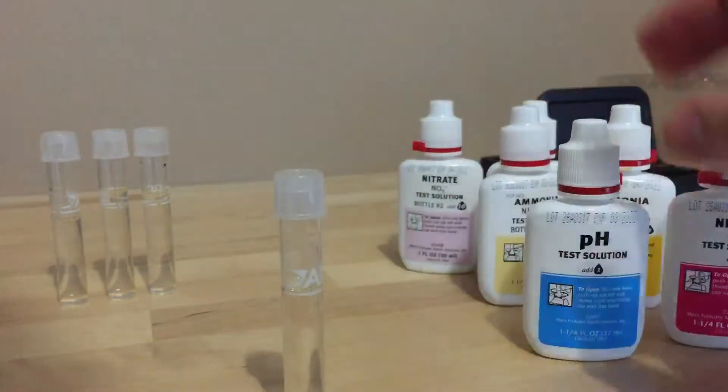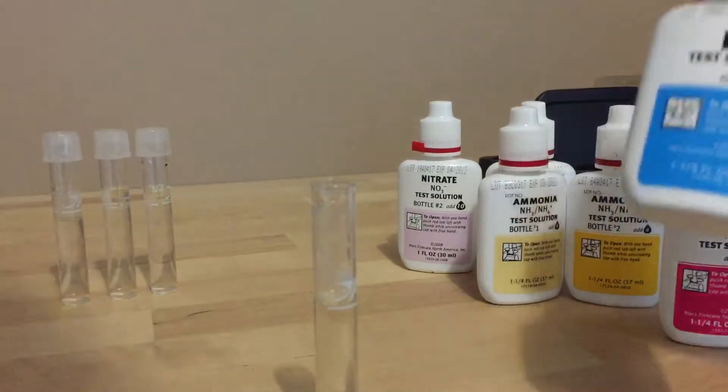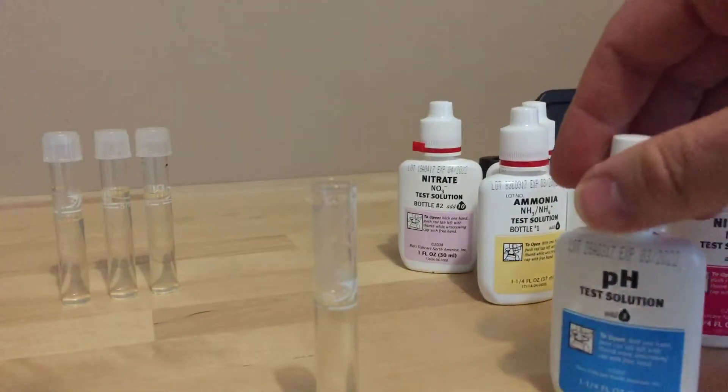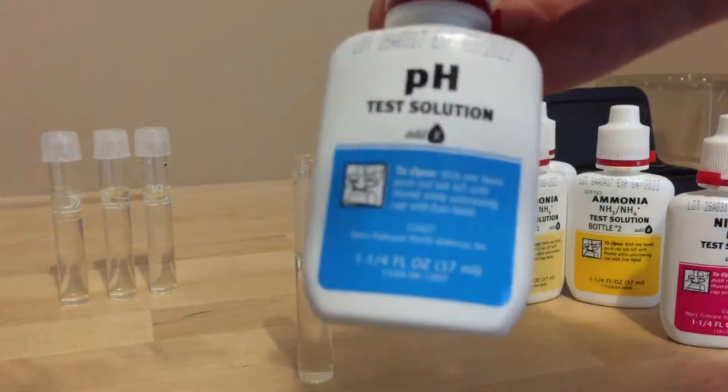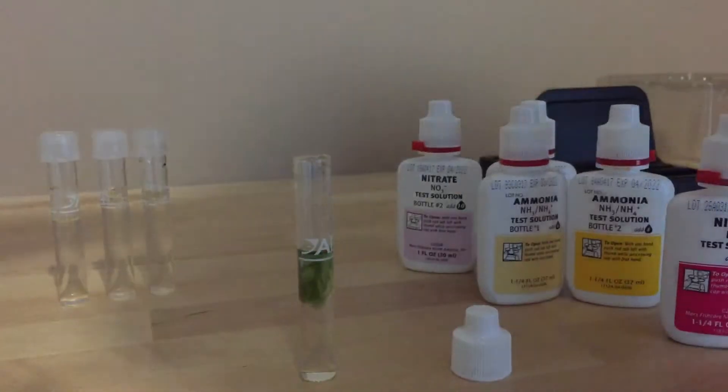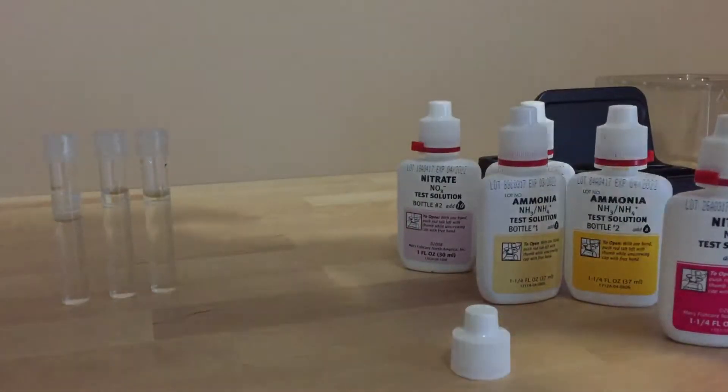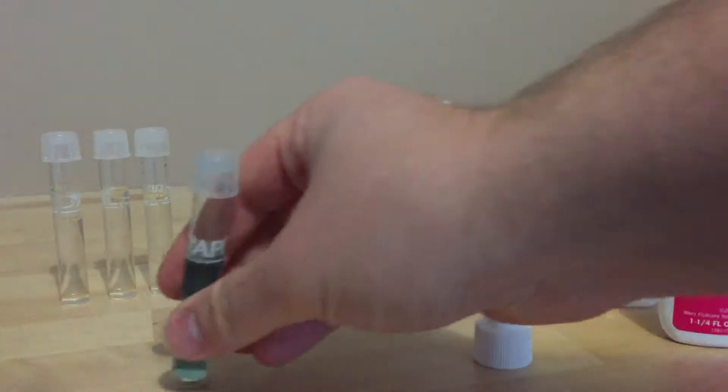So the first one is pH. If I just take the top off, there's a detailed book that comes with it to tell you how to do each test but also as a handy reminder on the bottle as well. For pH it just says add three drops. It's as simple as that. Just add three drops, put the cap on, just give it a quick shake and then you can just leave that.